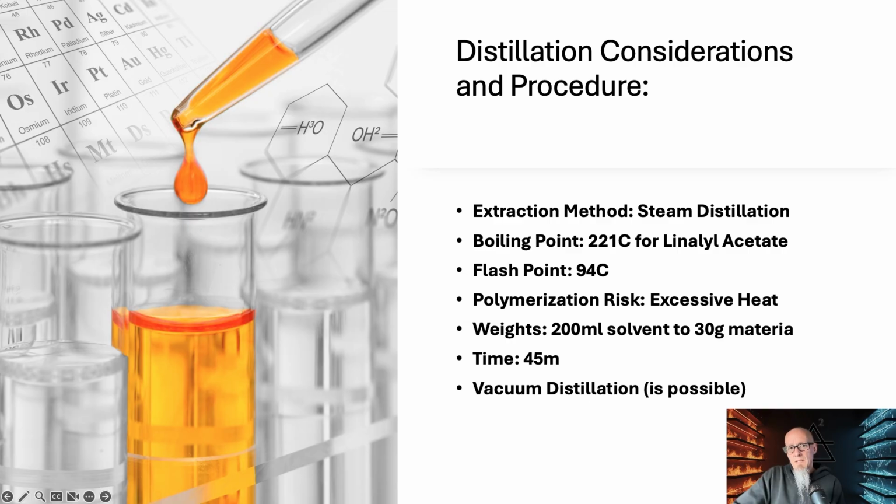Okay, distillation considerations and procedure. So our boiling point, 221C at 1 atmospheric, 1 ATM, right? So at an atmospheric pressure of 221 Celsius, that is the boiling point of linalyl acetate.